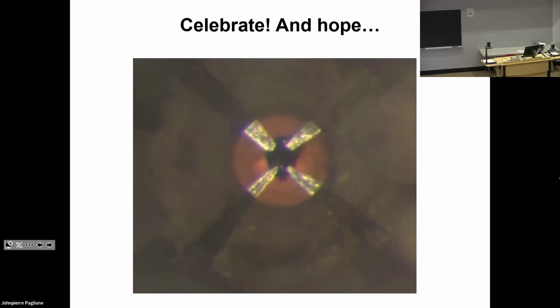What I would do is look down at my sample that I've loaded and keep track of where I want the ruby to go. Then on my cylinder, on that diamond which isn't touching anything, I'll keep in mind where the mirror image should be, such that when I bring it back down on top, it'll go directly into the correct spot. So you can take a picture with your microscope of exactly where you want the rubies to be, and then nudge them into the exact position they should be.